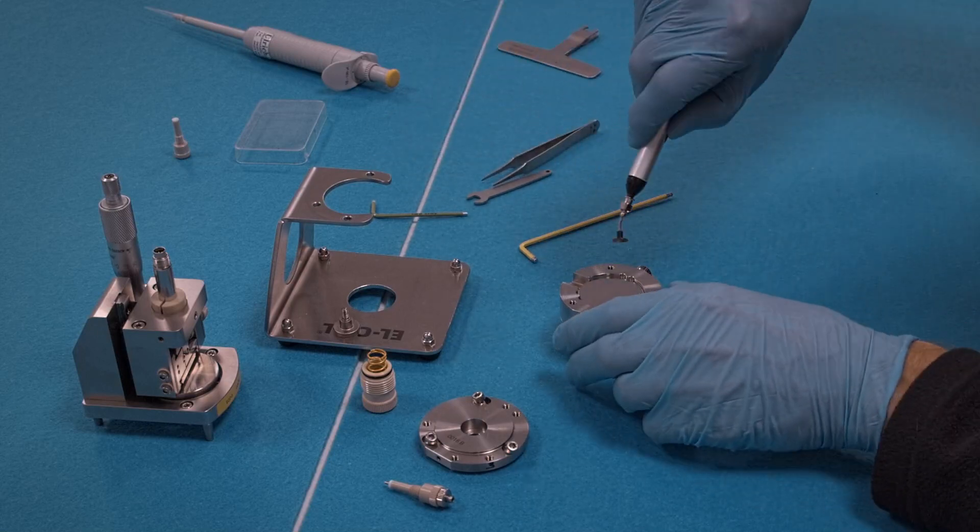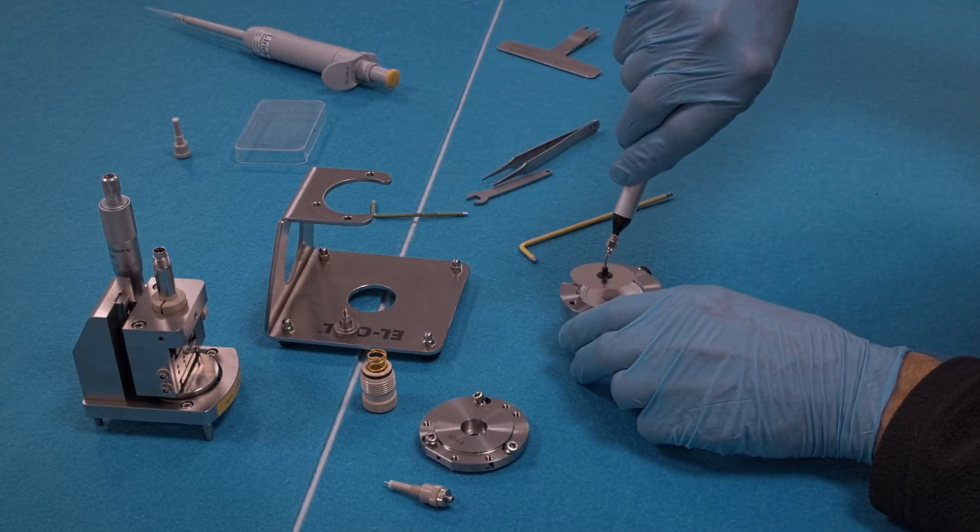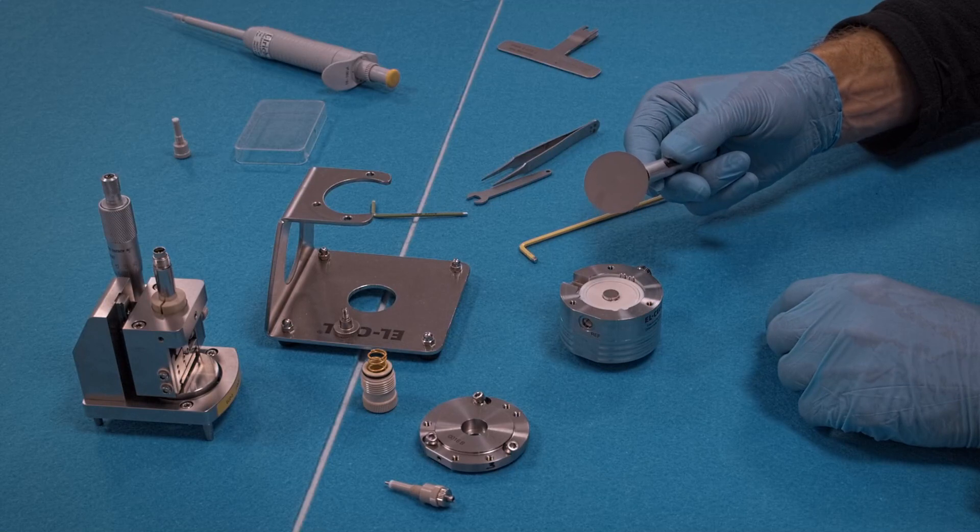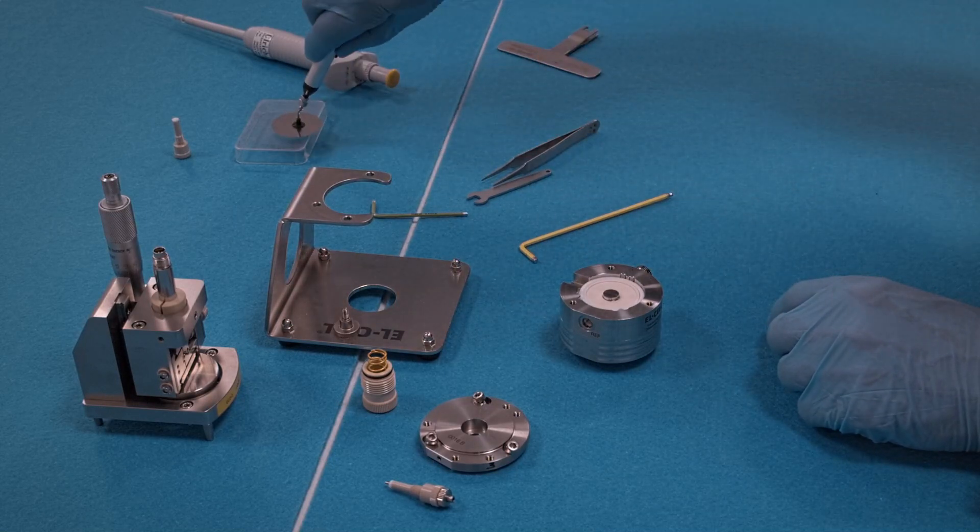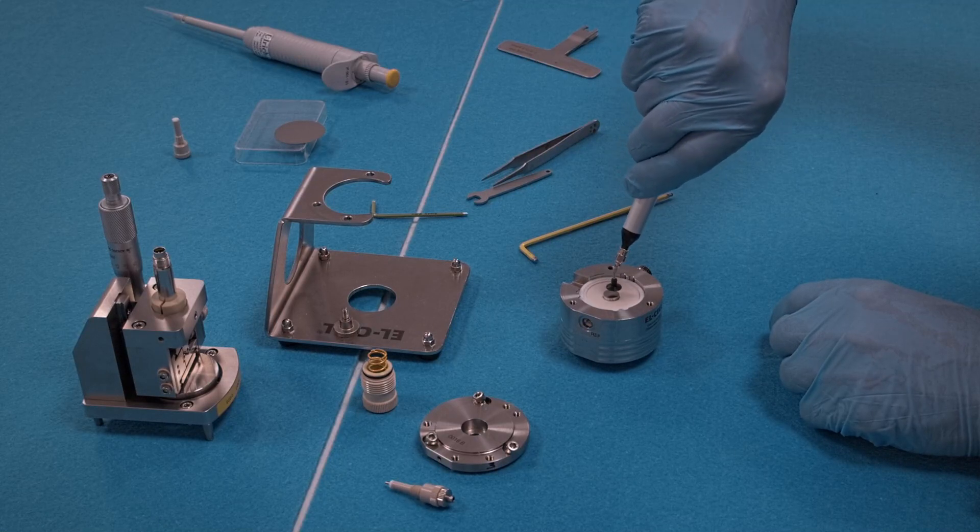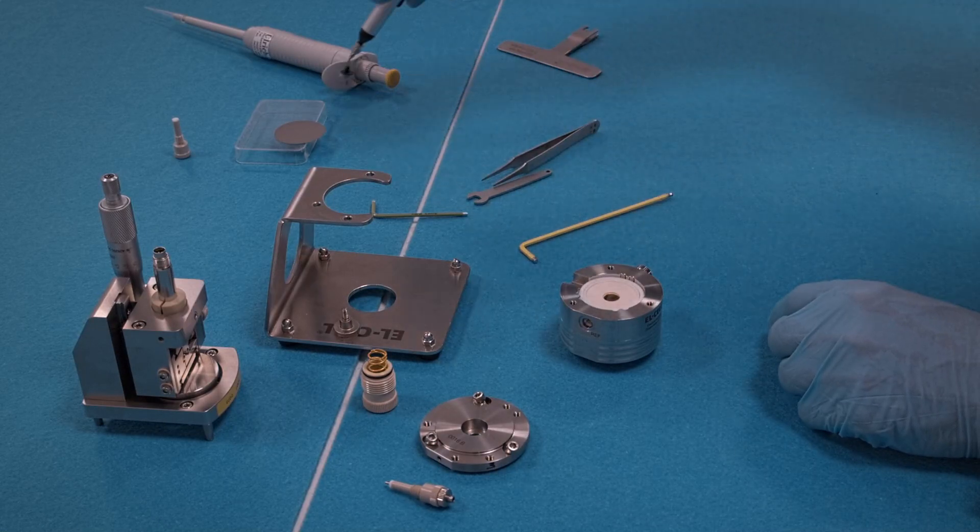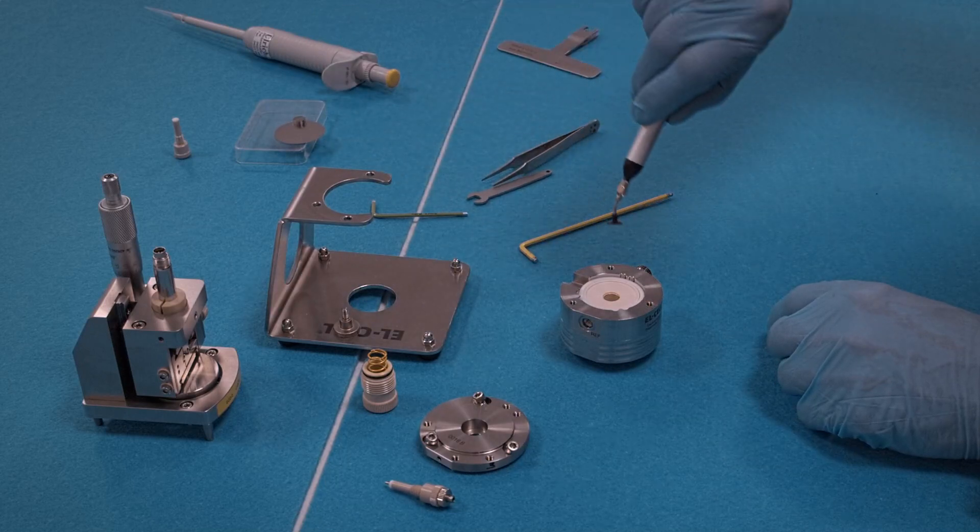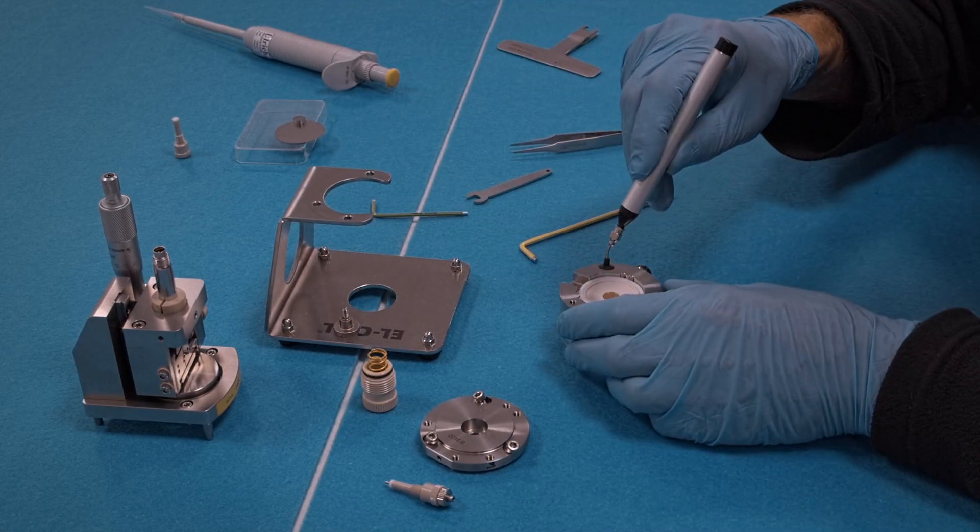Dispose the metal membrane, the metal foil. Remove the spacer disc which can be reused after cleaning and drying. Dispose the working electrode.